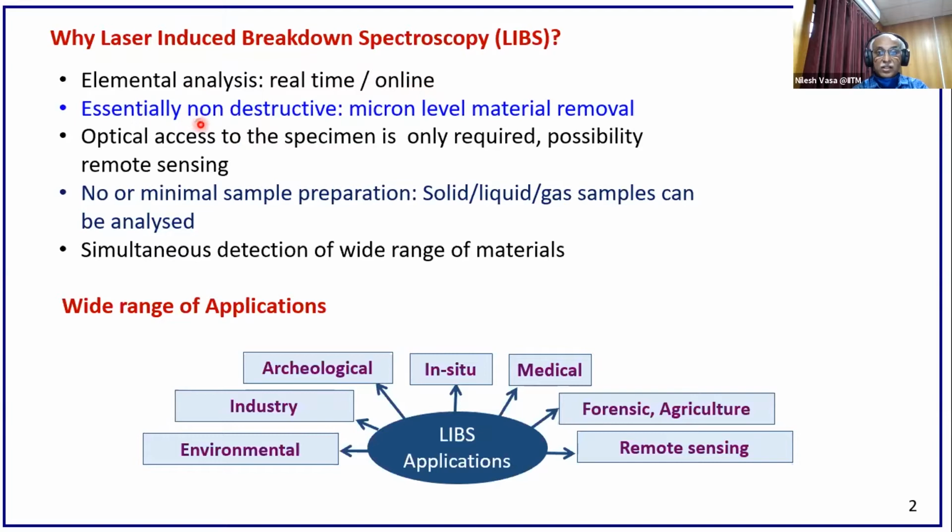It is non-destructive to a certain extent, because at the micron level material removal is possible, and hence by using such a micron level material removal approach, we are not disturbing the whole structure or whole measurement aspects. We are just trying to capture a very small amount of information from the ablation.